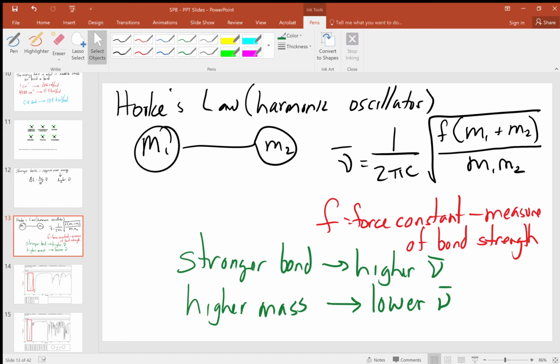So now what we're going to be doing is start looking at actual spectra and seeing where different functional groups show up. Now, typically you'll see this done as, here's a chart and you'll find alcohols show up here and ketones show up here. But I think it works a lot better when we do that by looking at actual spectra. So what I've done, you'll see them over the next 25 slides or so, is to look at each functional group that we should be able to recognize in an IR spectrum.